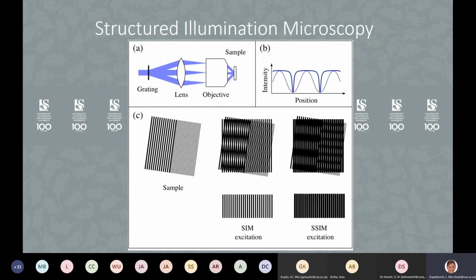So let's talk about structured illumination. When you put a sample in, I want you to imagine that this is a sample of muscle. It's the type of sample I know best that has striations. This is not something physical, this is your sample. If you overlay in the beam path something that has a very predictable structure like this grid pattern or grating, if you overlay that over your sample, you see a new pattern.